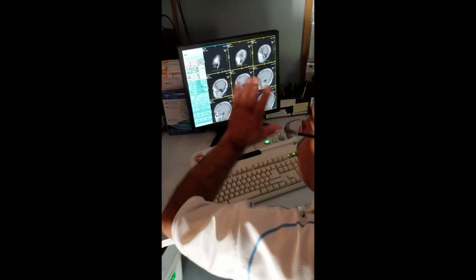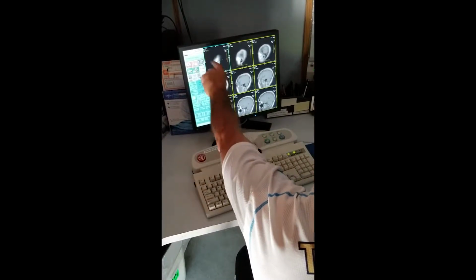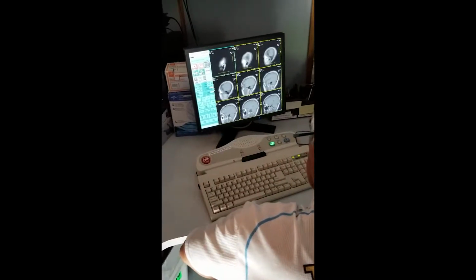Remember, we went too far. You said it's not covering enough. Yeah, there's nothing really there. Maybe it starts from here. So, next images.